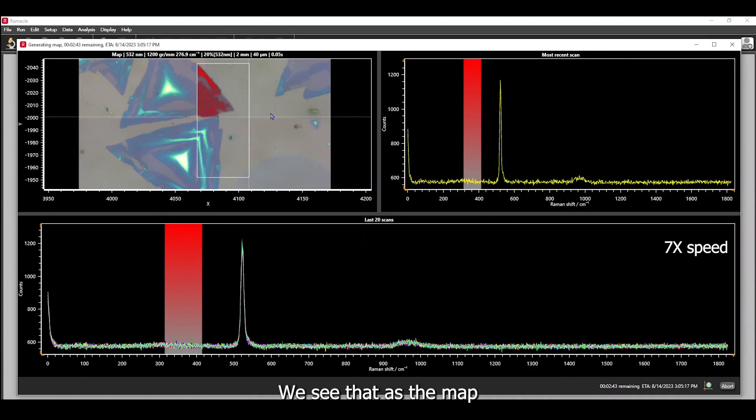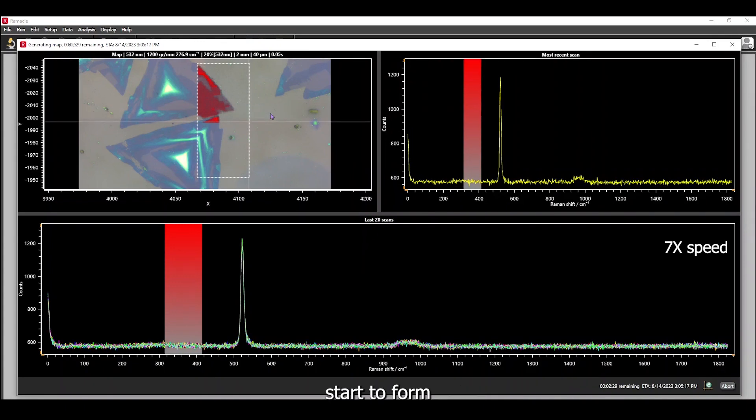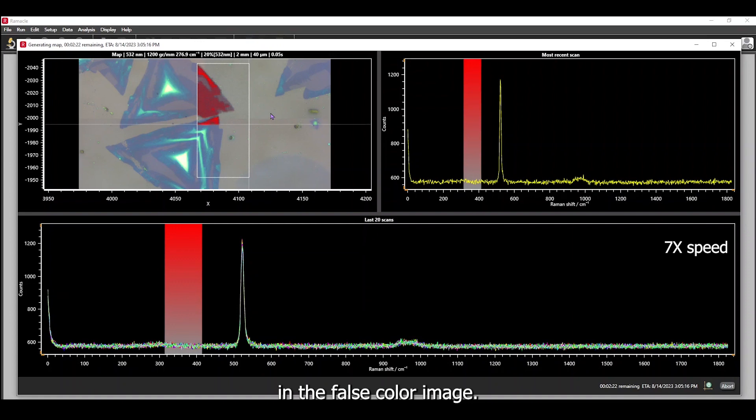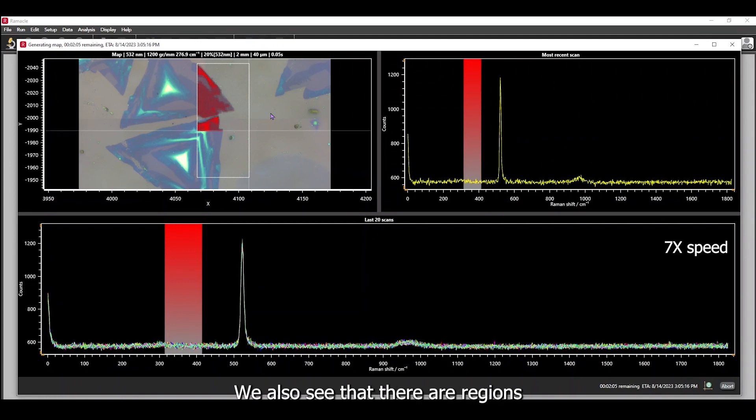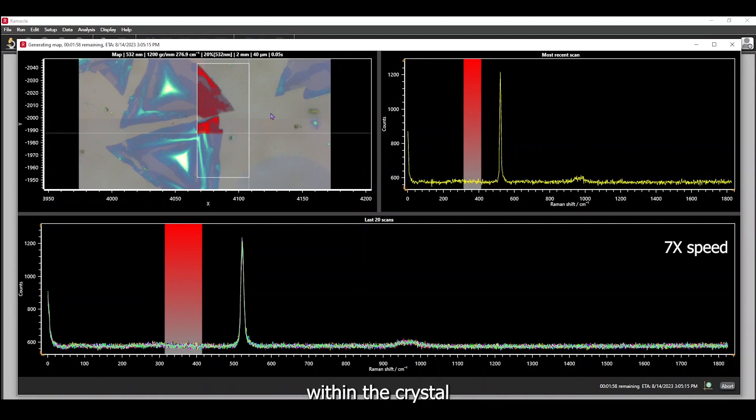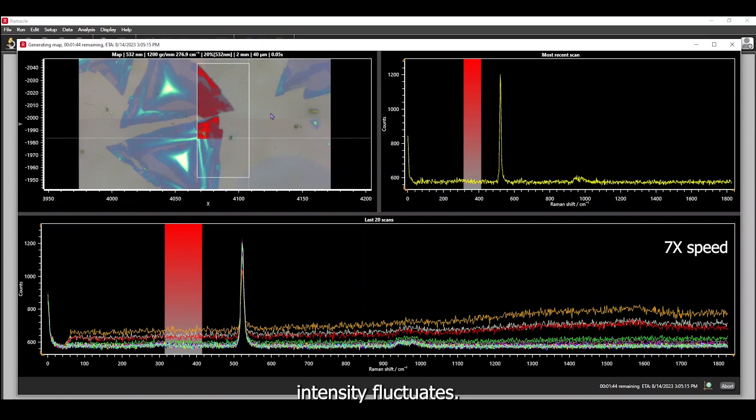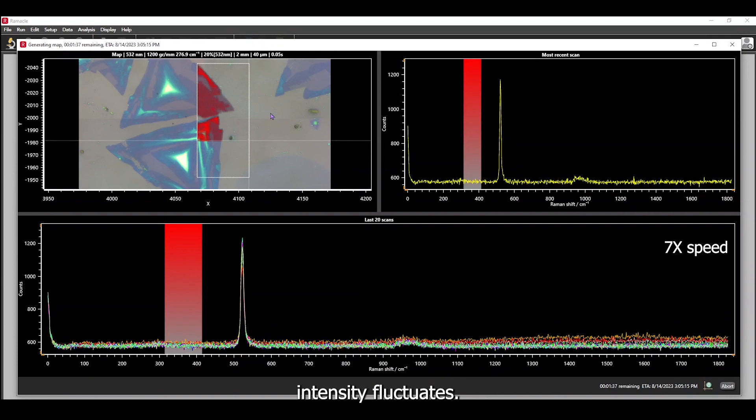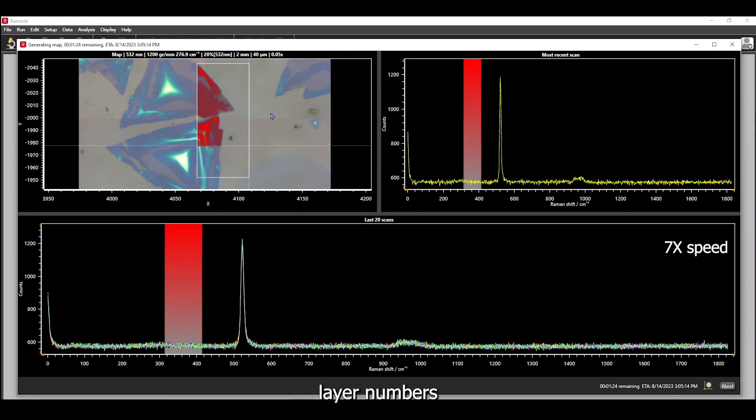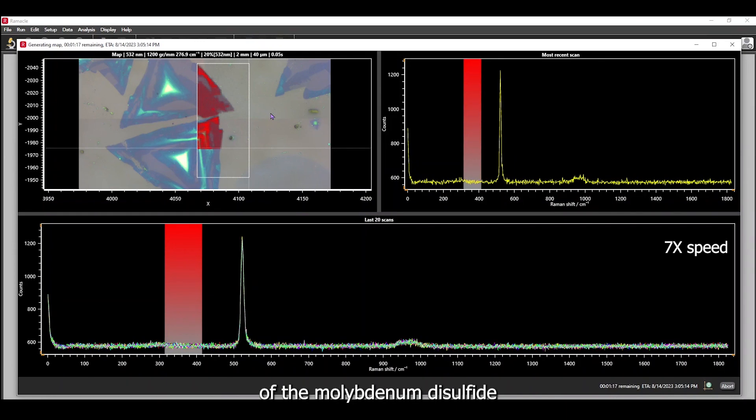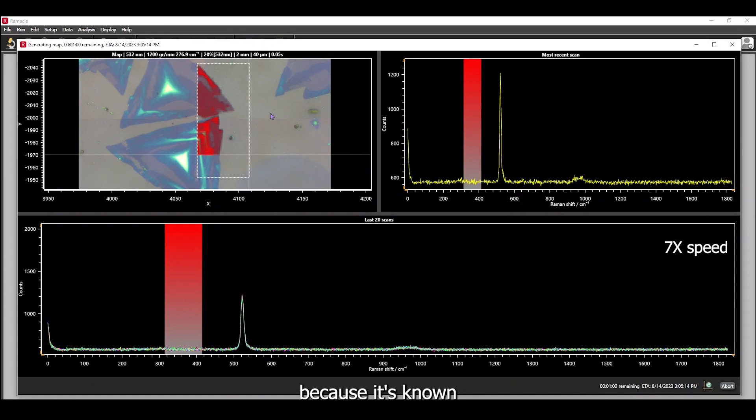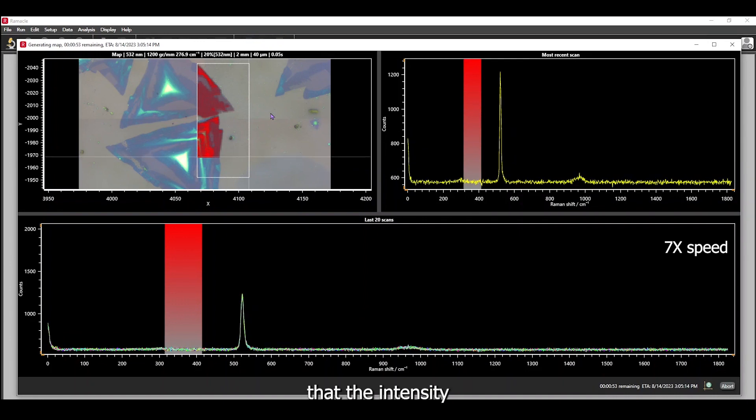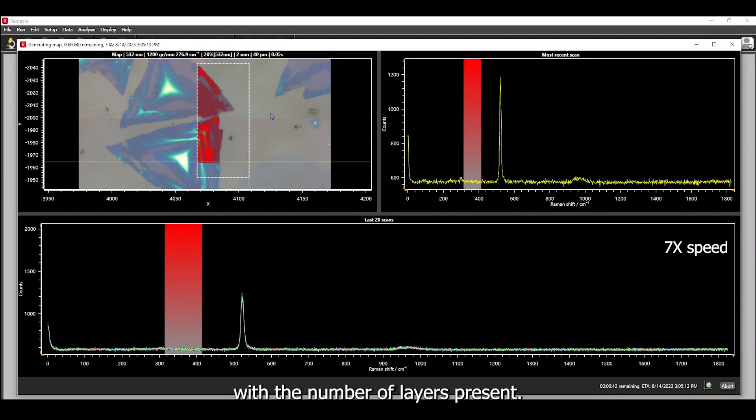We see that as the map updates, the outline of our crystals start to form in the false color image. We also see that there are regions within the crystal where the spectral intensity fluctuates. This is due to differing layer numbers of the molybdenum disulfide, because it's known that the Raman intensity of the material increases with the number of layers present.